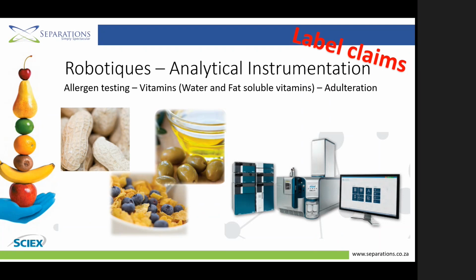A lot of labs start out with HPLC and later migrate to LC-MS, and that is just starting off by having your nutritional testing and later doing your more sophisticated analysis, which is a bigger investment, more expensive tests to do, and also your laboratory training or taking your analyst from HPLC to LC-MS as well. So that's usually your next step, going from HPLC to LC-MS.